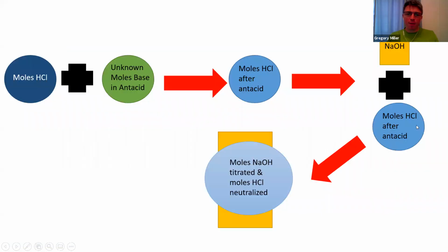Let's see, I'll put it here. So you end up with some carbonic acid. And where all of this comes from is the antacid tablet. A lot of antacid tablets use some kind of carbonate active ingredient, which forms this buffer system. If you ever look at Alka-Seltzer tablets, when they fizz, that's them releasing various bicarbonates that get turned into CO2, carbon dioxide, that then bubble out.